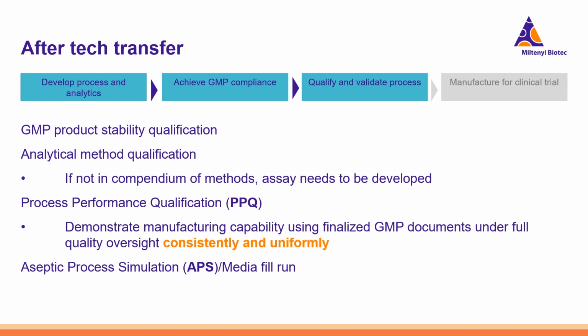And this means running the process using the finalized GMP documents under full quality oversight and demonstrating that the product can be produced at consistent and uniform quality over and over again.